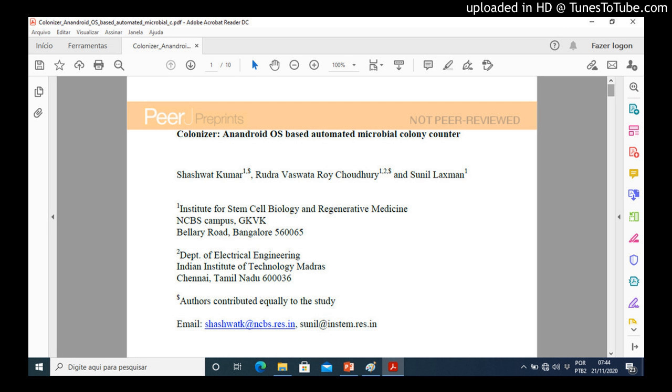The execution time ranges from 20 seconds for the Micromax Key 4014 to 8 seconds for the Moto G4 Plus. It is to be noted that the Colonizer app does not require the user to manually select any parameters, and the image processing algorithm is completely automated. Thus, it can be stated that a significantly short time span is required to analyze the image and produce the count.